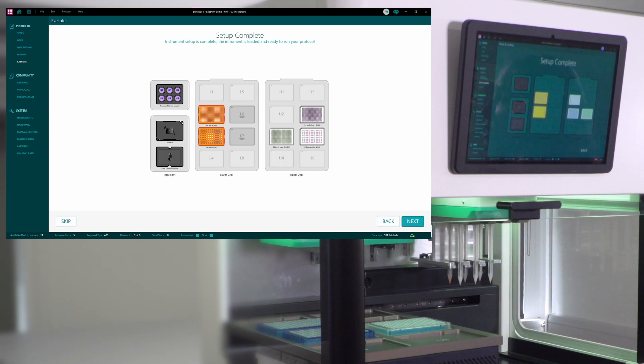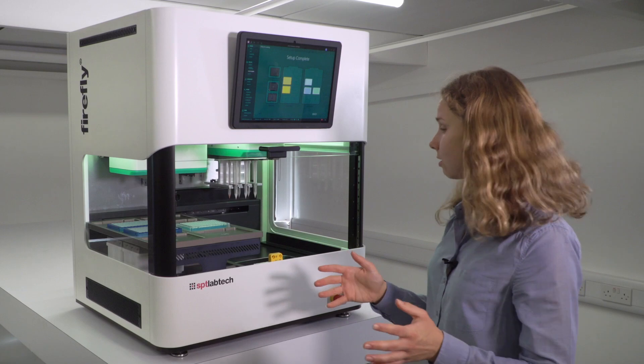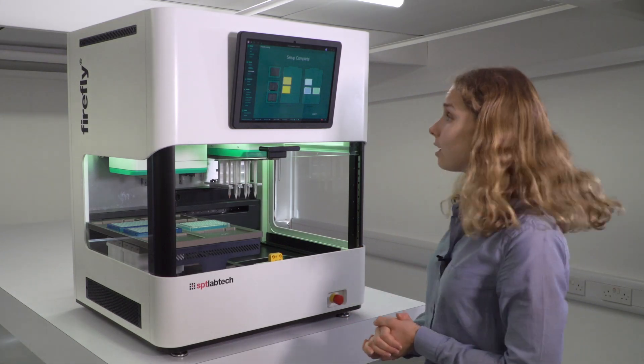And now the setup is complete. So now my instrument is in the right position, and it has everything that's required to start running the protocol.